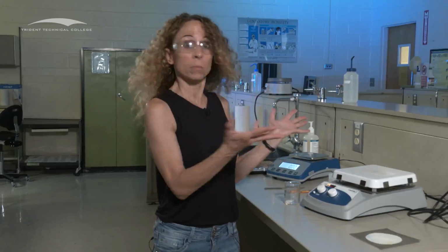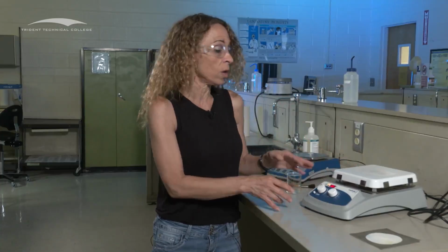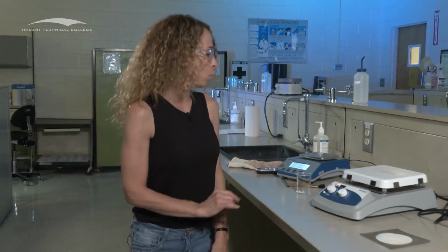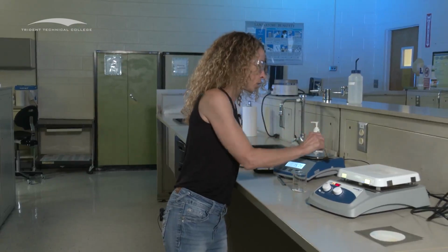Let's say, okay, oh look, I got the 0.01, I crossed that hurdle. What are you going to do? I'm done, I'm going to leave. No, you're not. You're going to make sure that your balance is clean. Okay, brush it off for the next person.